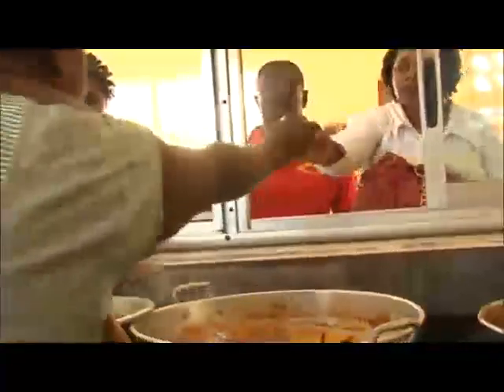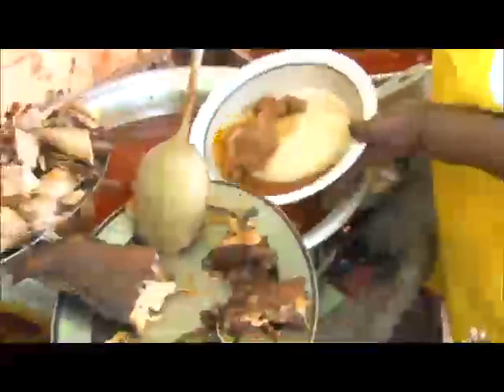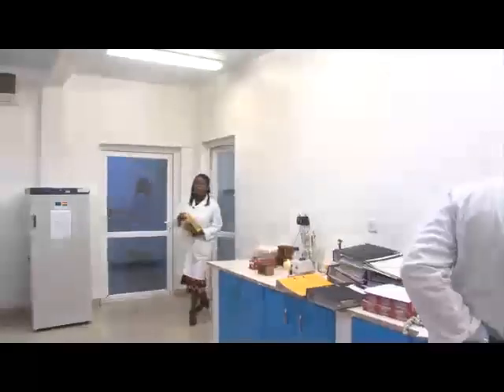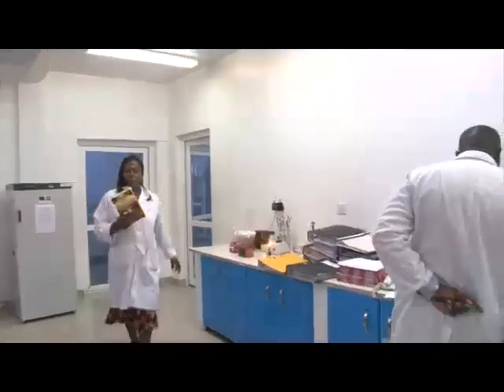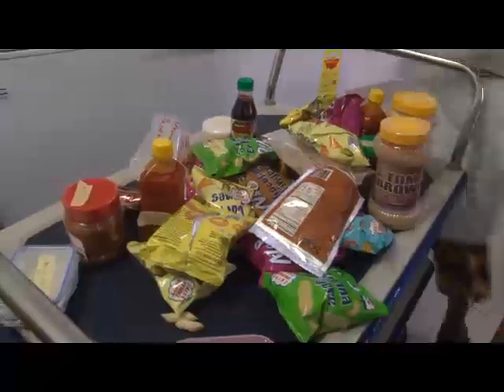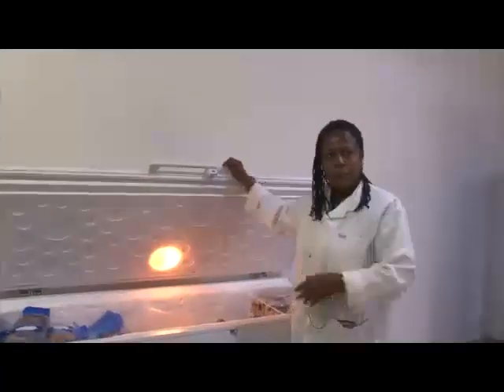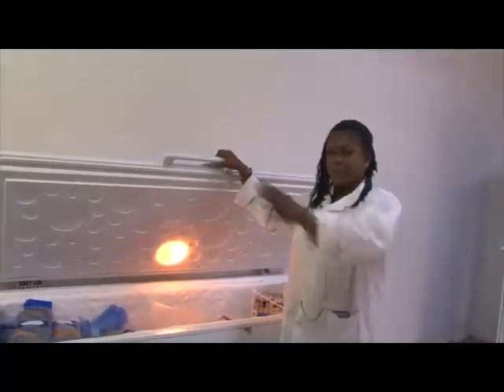An often repeated warning by medical scientists: eat healthy foods and test your food or face health problems. A greater percentage of human illnesses, some fatal, are diet-related. The CSIR Food Research Institute in Accra proves that the item you may be putting in your food, or the food in the collective sense, may not be free from pathogens. A pathogen is a bacterium, virus, or any other microorganism that causes disease.